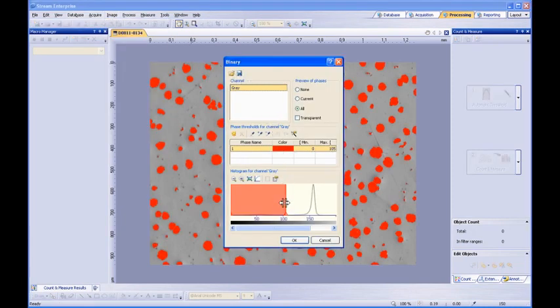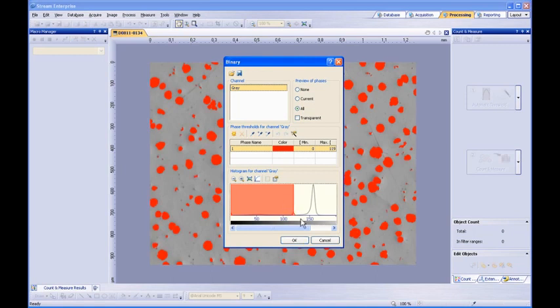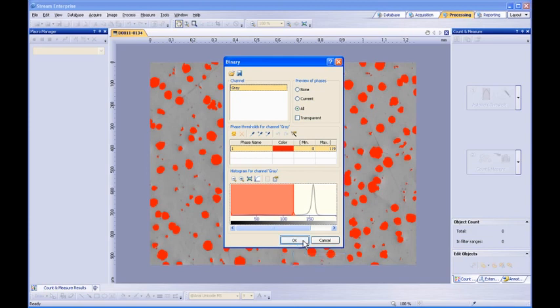Now we can select which grayscale values are binarized to black or white via grayscale thresholding. After you have selected which grayscale values are to be binarized accordingly, simply press the OK button.